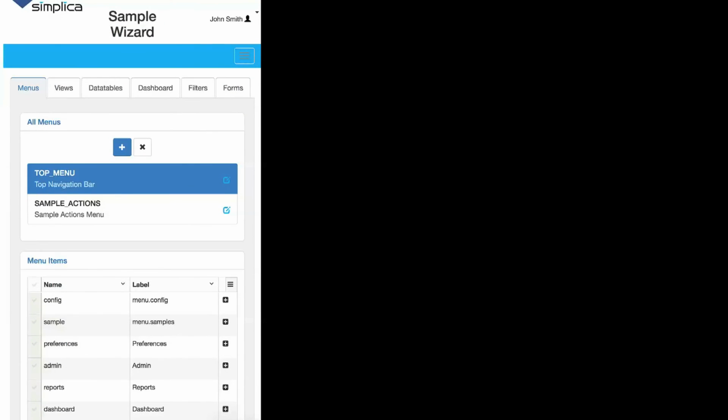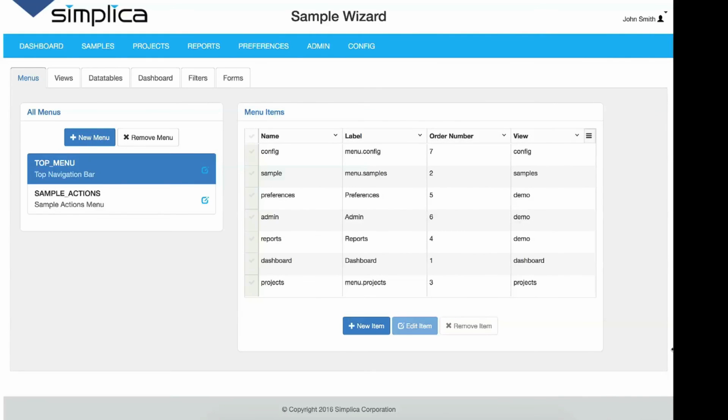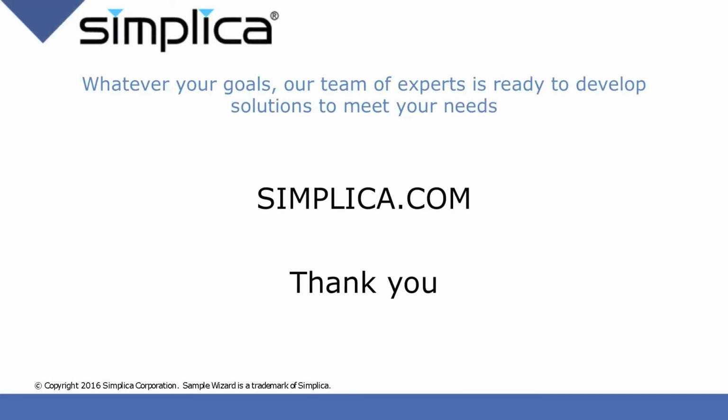As you can tell, there's lots of features here for Sample Wizard, and I've chosen just the major ones to show you here today. Well, that concludes our Sample Wizard webinar.